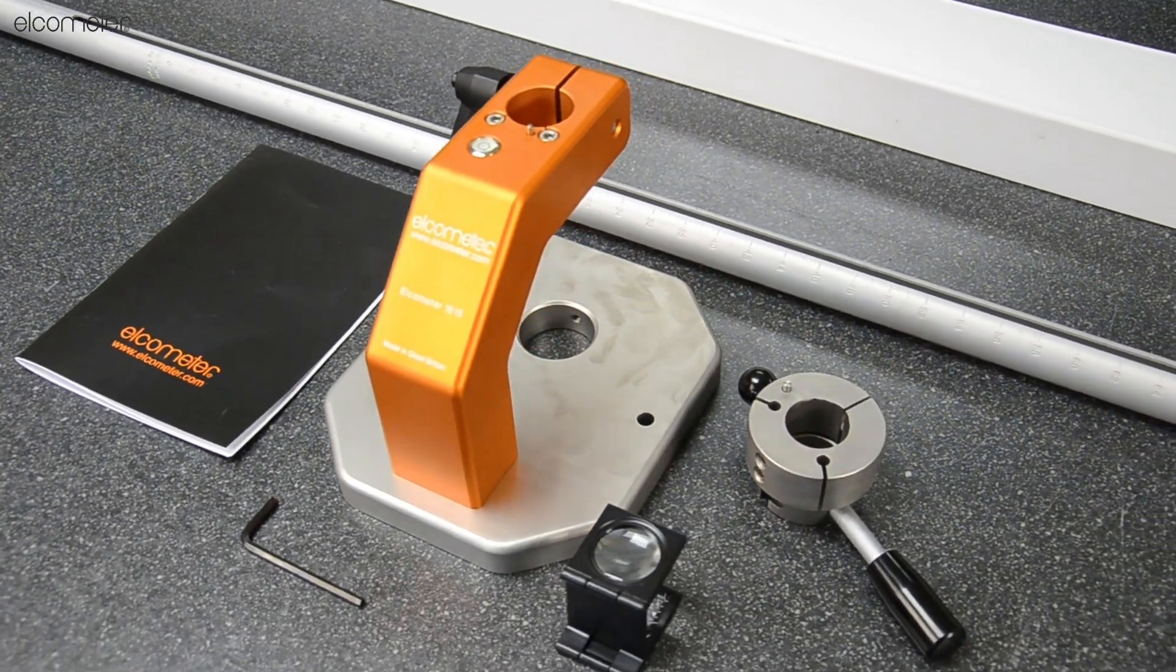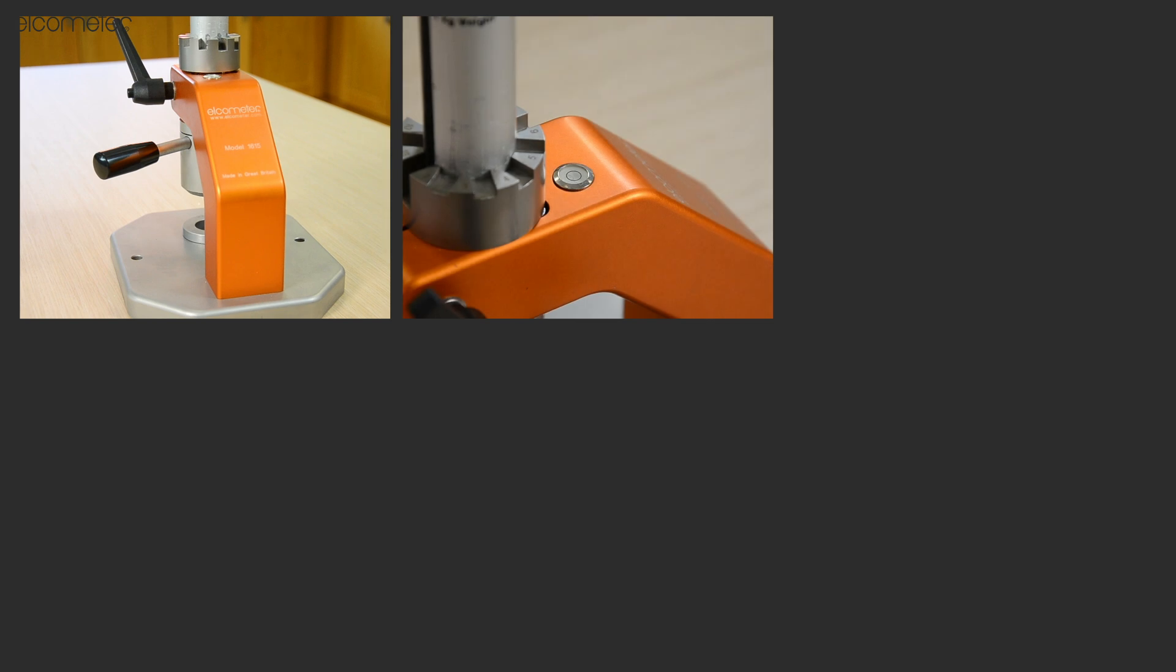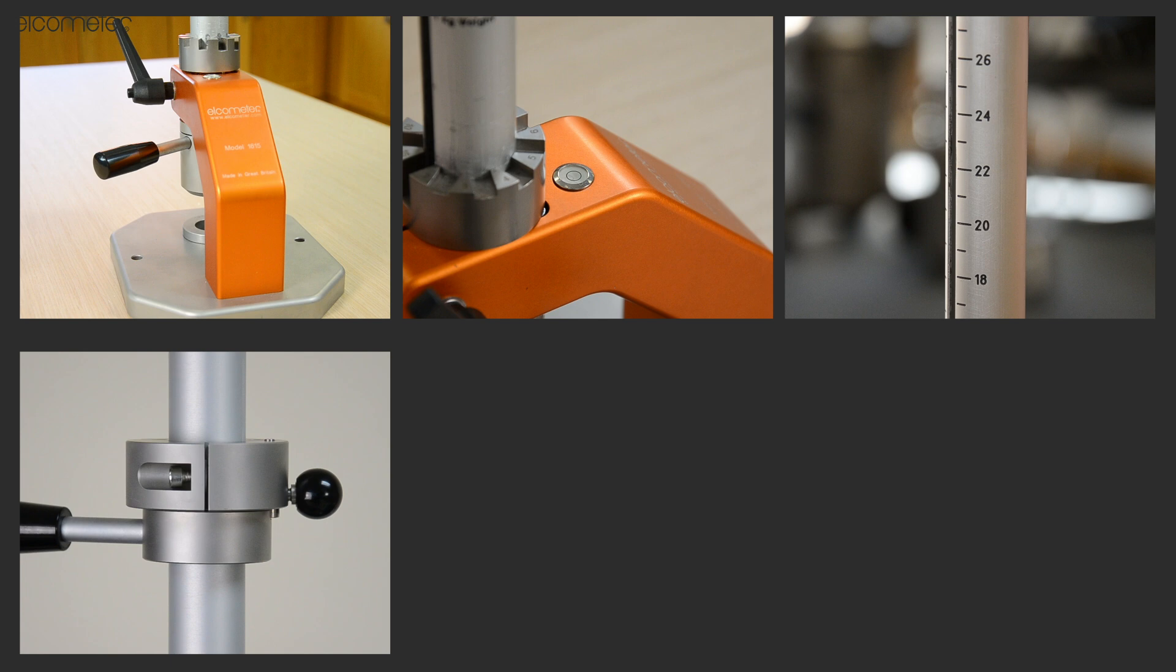The Elcometer 1615 Base Unit Kit contains an impact tester and base with an integrated bubble leveler, a graduated tube, and a collar release mechanism to hold and release the weight or indenter.